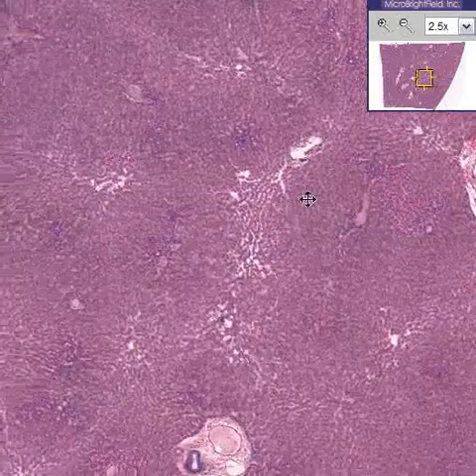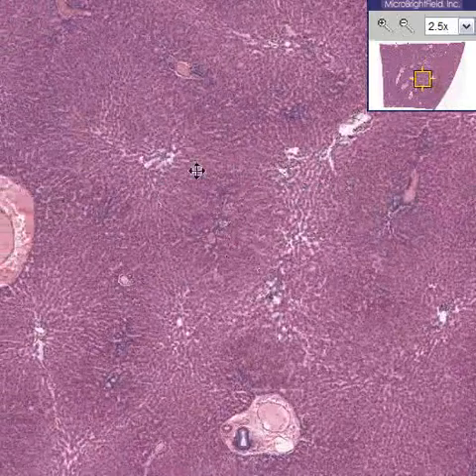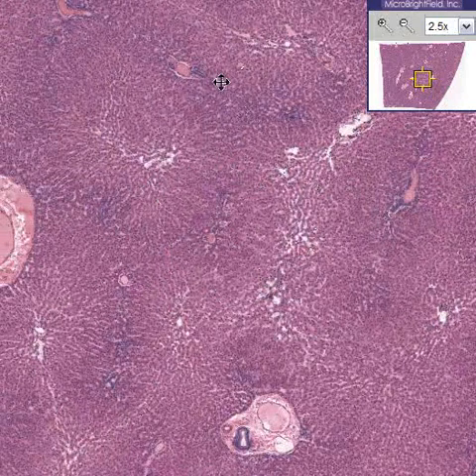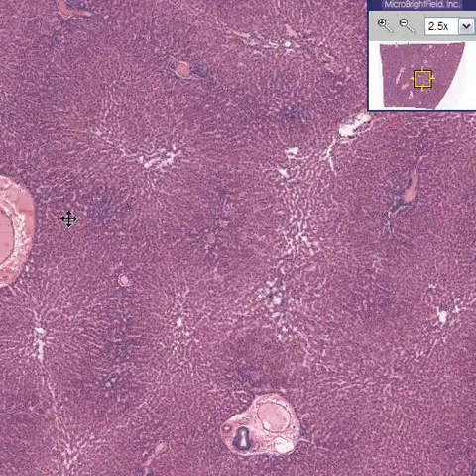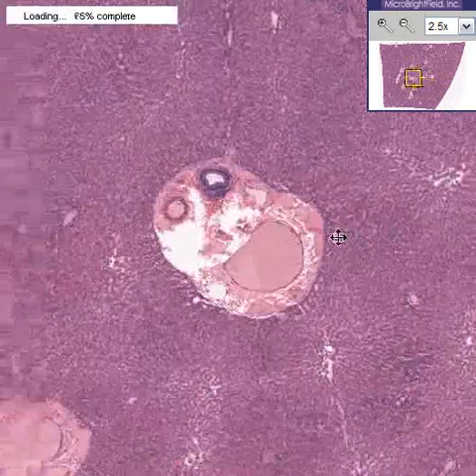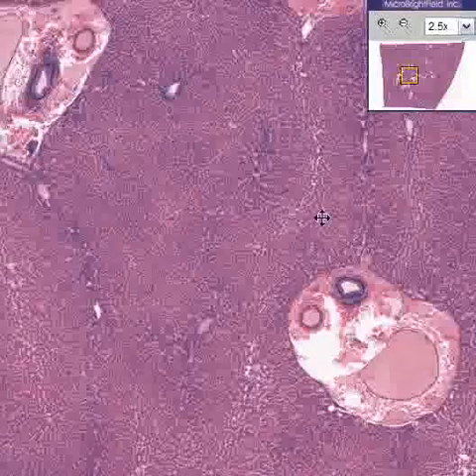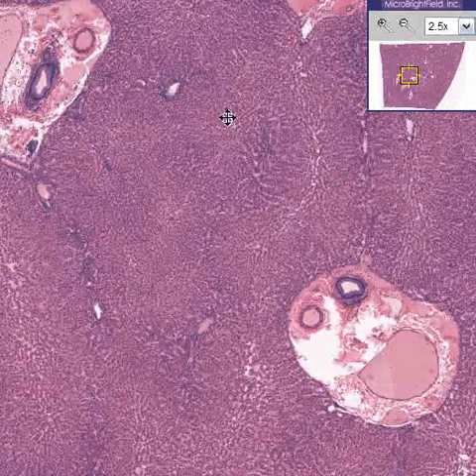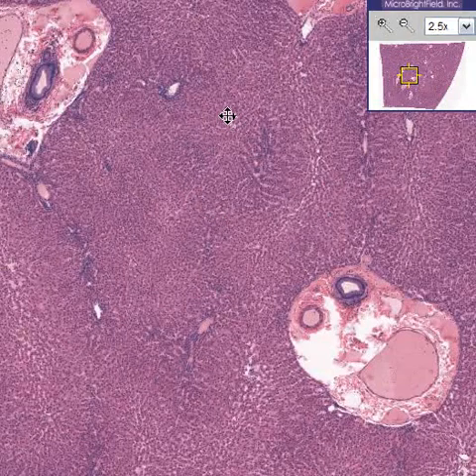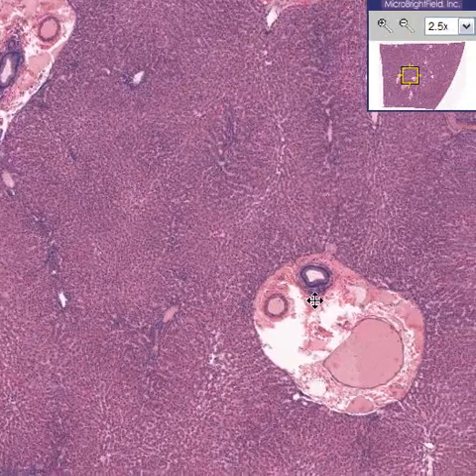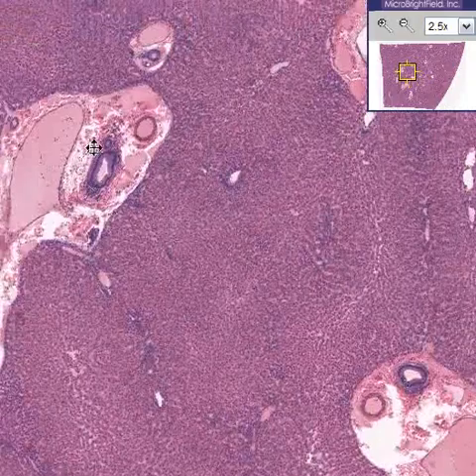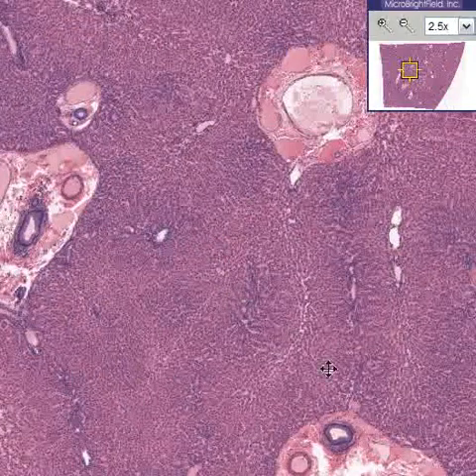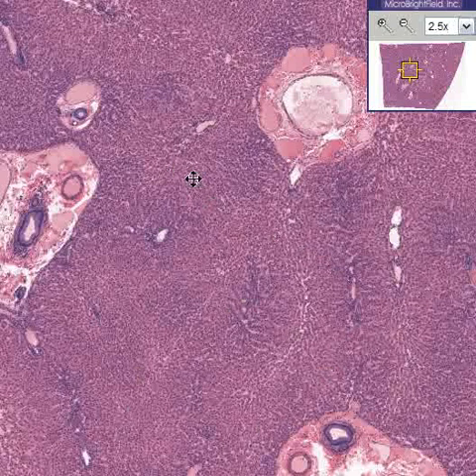Notice that the lobules of the liver — there are lobules visible all around. You can actually see lobules on the gross specimen if you look very closely, though they're really hard to delineate because they don't have any connective tissue separating them. The only connective tissue you see in a liver is in a portal area or perhaps as part of a blood vessel. Otherwise the vast majority of the liver consists of lobules with no connective tissue.